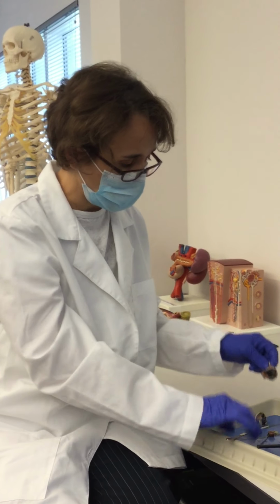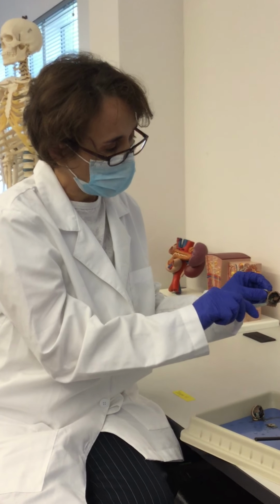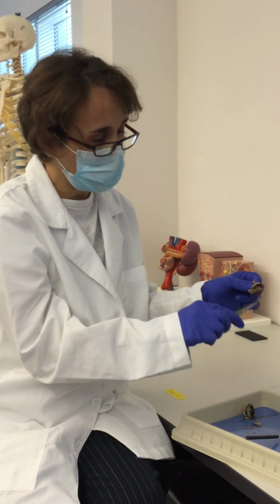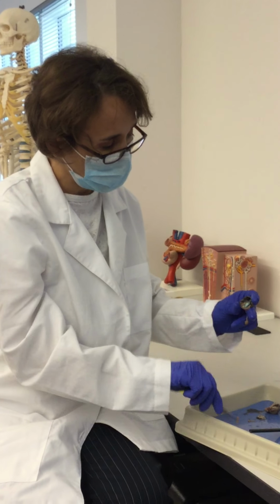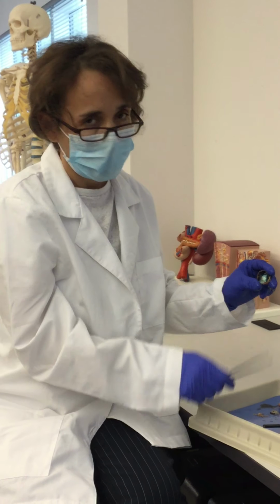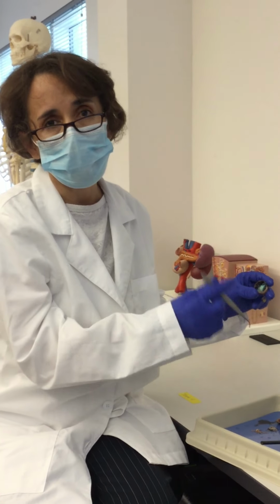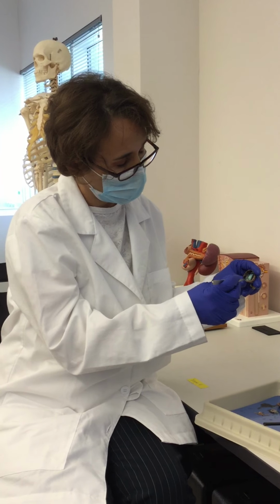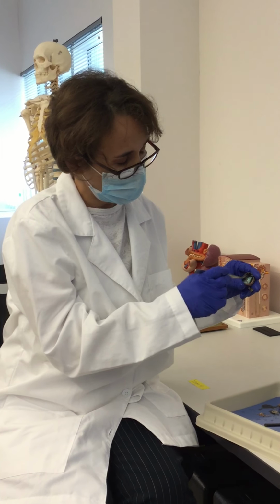Now this cornea, together with the lens, which is a biconvex structure located in here, held by these suspensory ligaments, which are these, helps to focus the light into the posterior region of our eye, in the internal layer, which is the retina. And you see these colors on the retina? These shiny colors are coming from the pigments that are found in the pigmented retina, the pigments stored within the photoreceptors, the rods, within the retina.